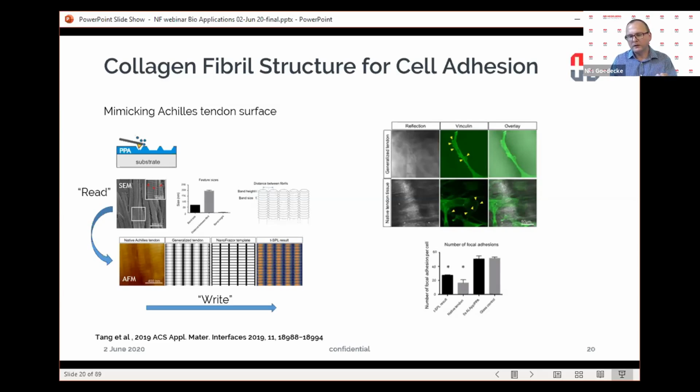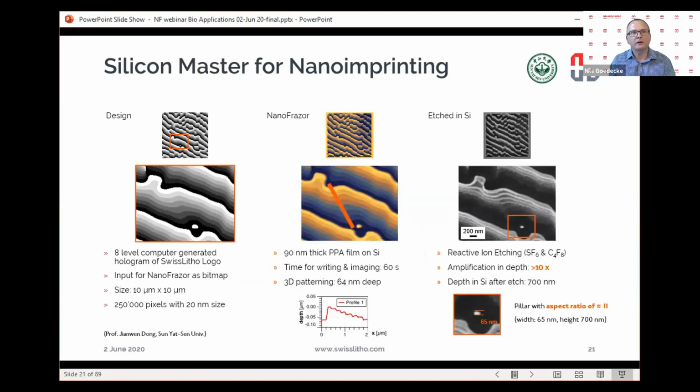take an SEM image and transfer it into an idea. Hey, let's see how deep is the structure. Can I sort of do an AFM? Can I use my AFM measurement, transfer it into a design, and use this for experiments? And I sometimes think I would even go a step further and use my images that I've acquired directly. That would be the next step.